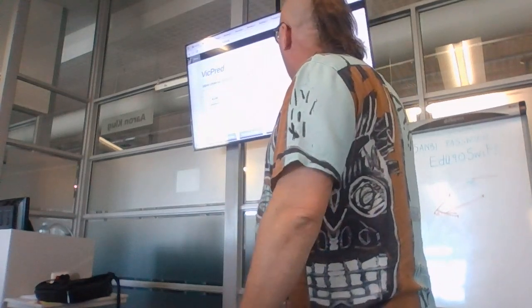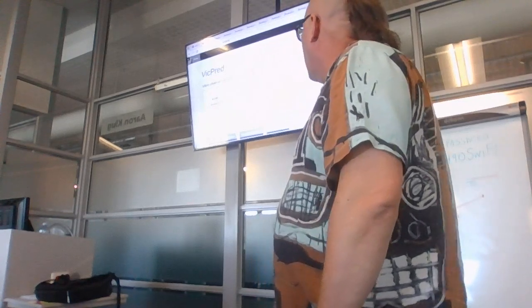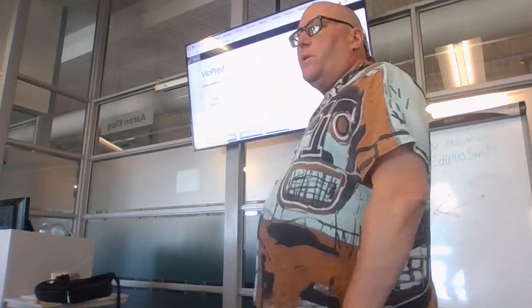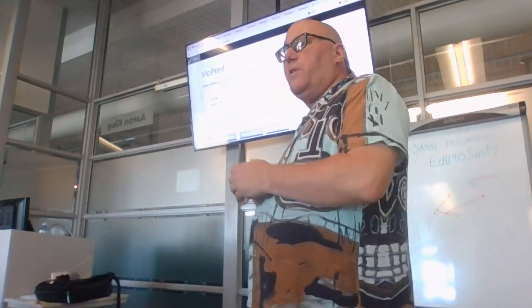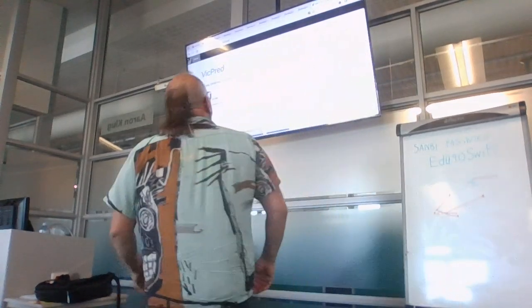Okay. Yeah, it takes a little while to get an answer. Because you're characterizing your genome, you want to have the databases that are species specific and all of those kinds of things.